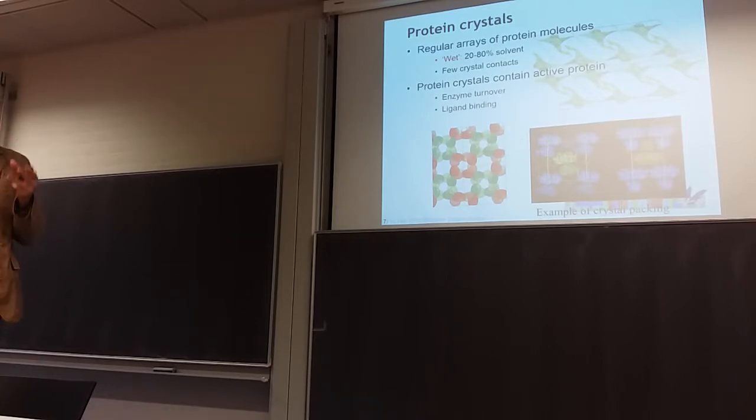So most of the protein in the crystal is actually still interacting with water, not with other proteins. Right. So this also means that in many cases, if you have an enzyme in a crystal, you can add the ligand, and it might be slower than in solution, but it could still be catalytic. If you need cofactors or other stuff, you have to add them too, obviously. But many crystals are shown to actually still have enzyme turnover in the crystal.